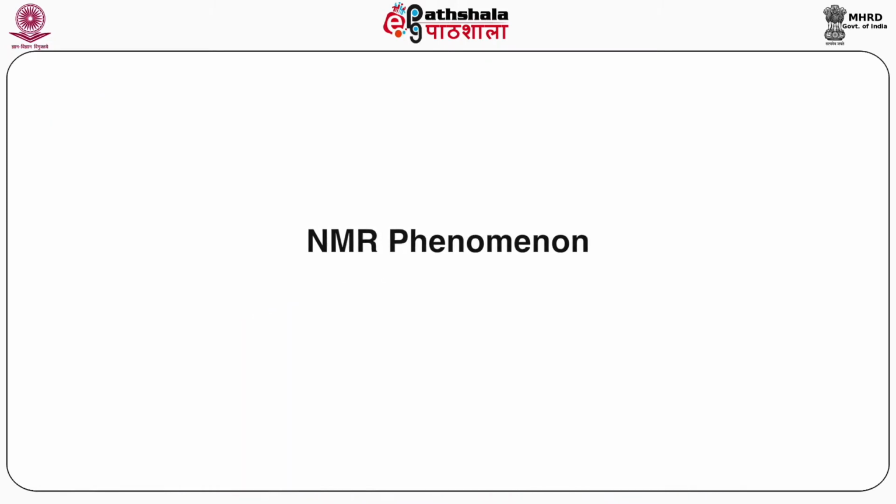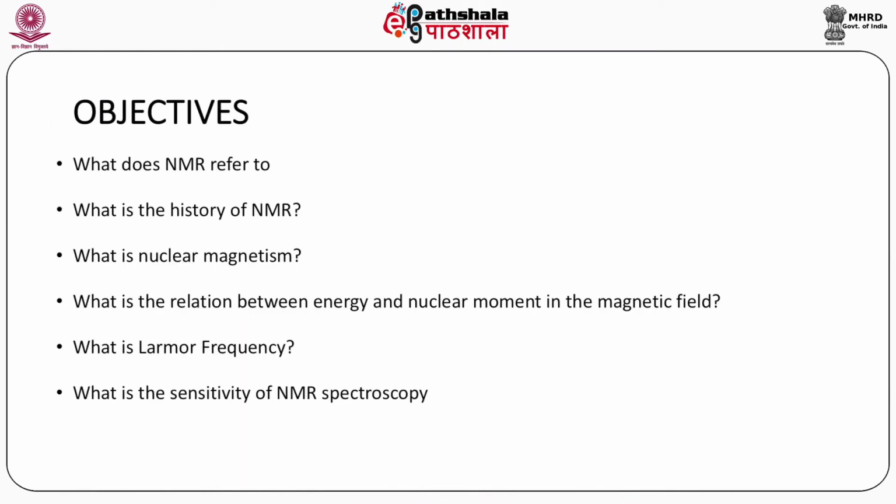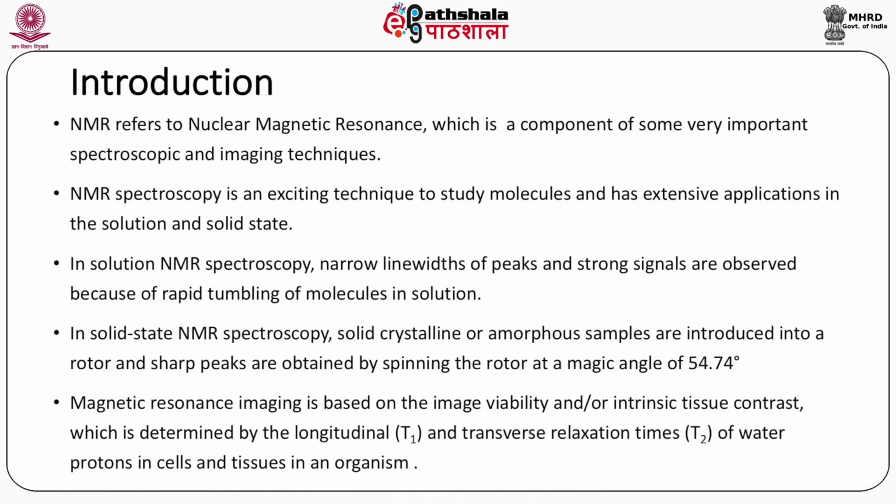We begin with the NMR phenomena. The objectives of my talk are to tell you what NMR refers to, how it developed, what the history of NMR is, what nuclear magnetism is, what the relation between energy and nuclear moment in the magnetic field is, what Larmor frequency is, and what the sensitivity of NMR spectroscopy is. So let's begin with the introduction.